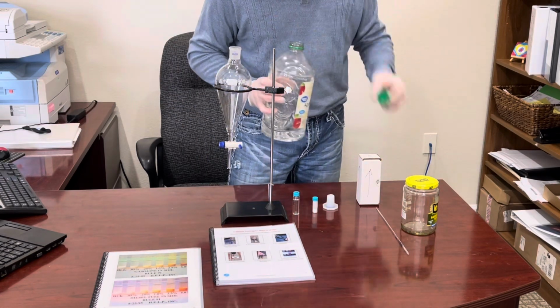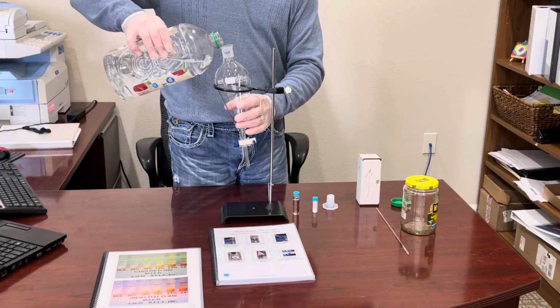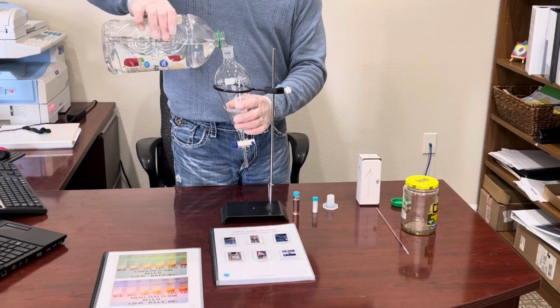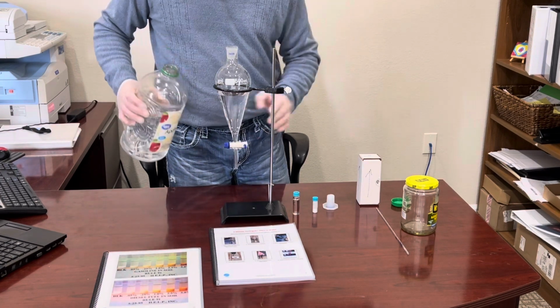We got some water here. We're going to put in our water sample. This is a 500 ml separatory funnel. There we go. We got our water sample in.